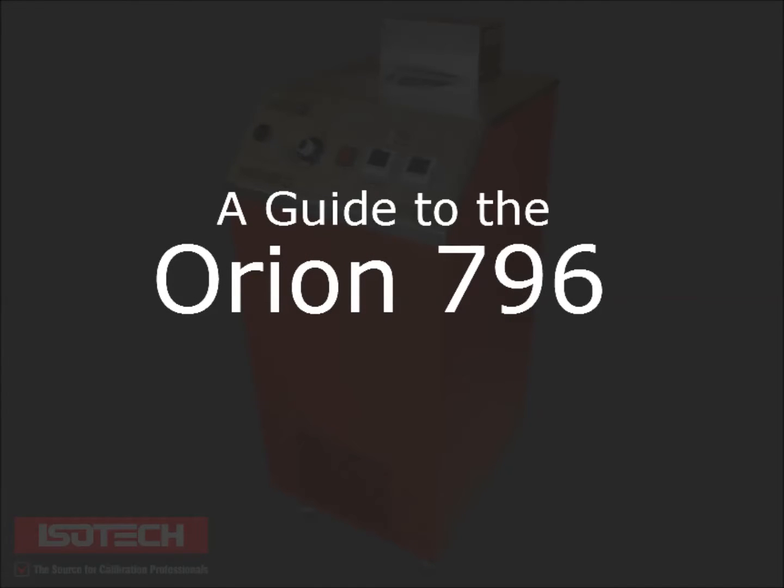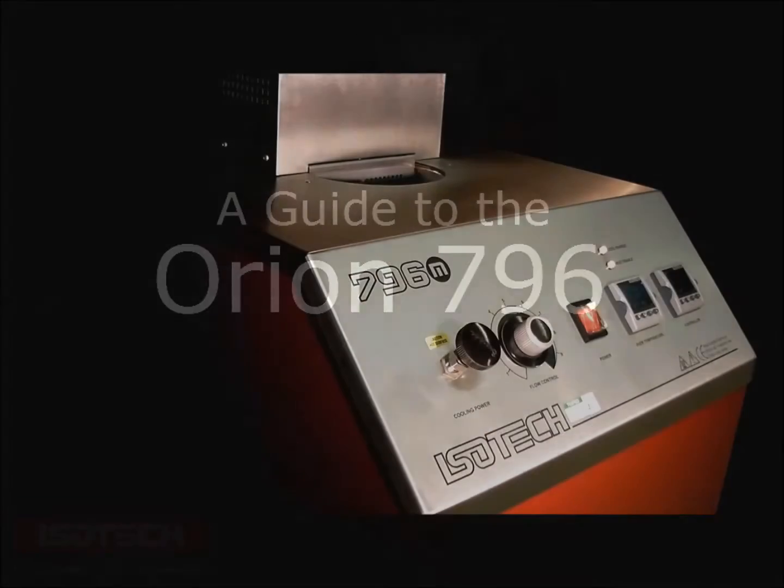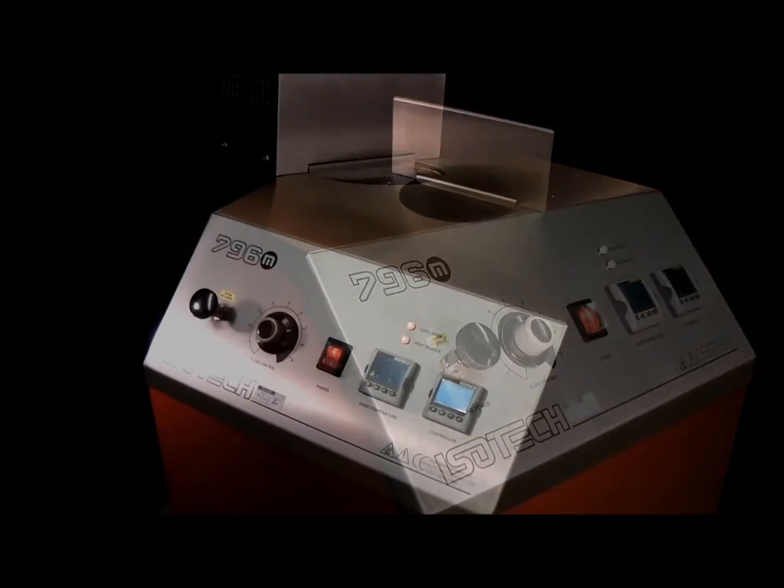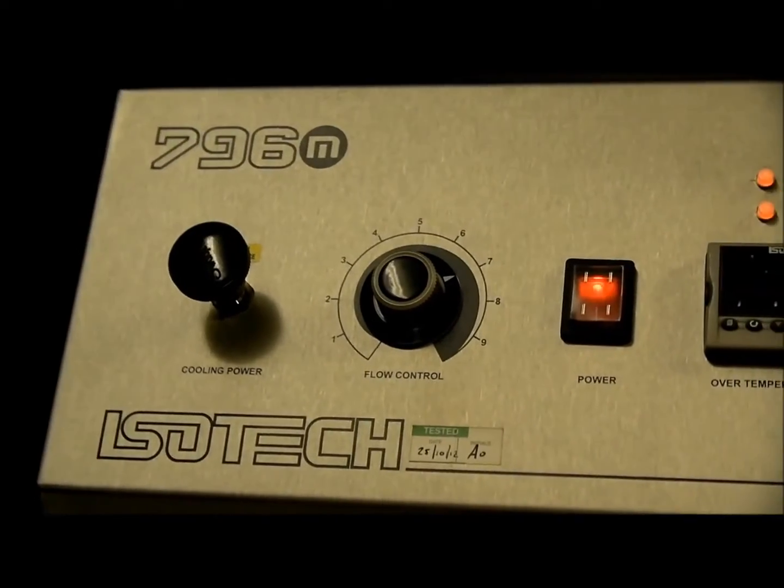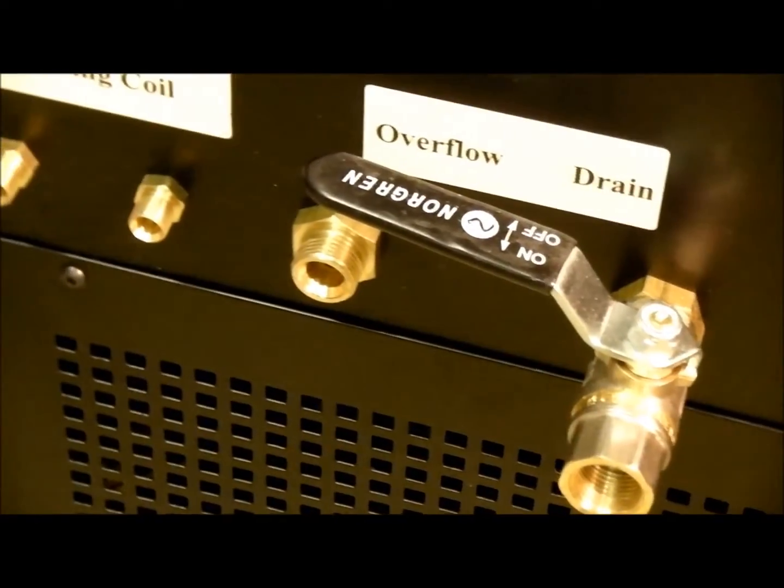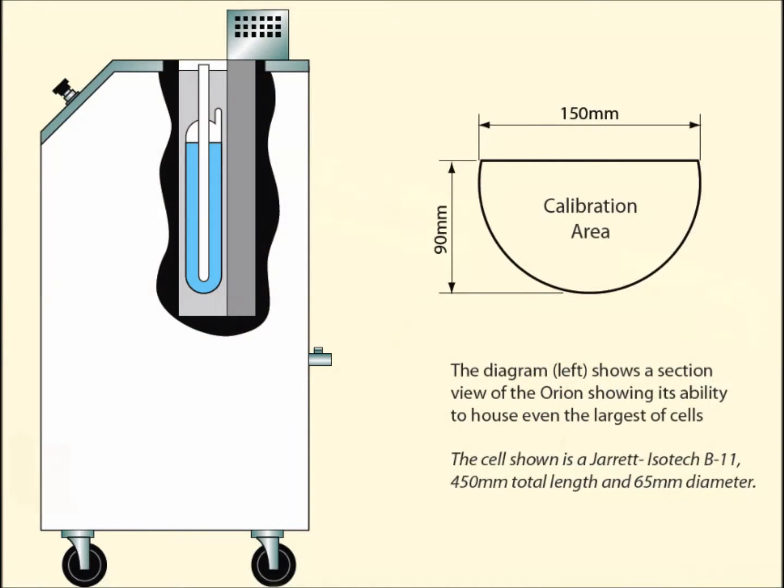A guide to the Orion. The Orion stirred liquid bath is suitable for low uncertainty calibration of long thermometers, including liquid in glass and extended length SPRTs. It has a depth of 470 mm.